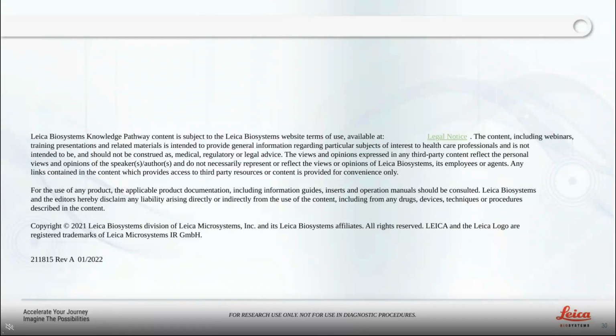That is a great question. There is no universal protocol for cryosectioning. Each tissue has its own characteristics, and each research project has its own needs. So for me, a good starting point will be finding a peer-reviewed paper or article that uses a cryosectioning protocol on your specific tissue type and for a similar application.